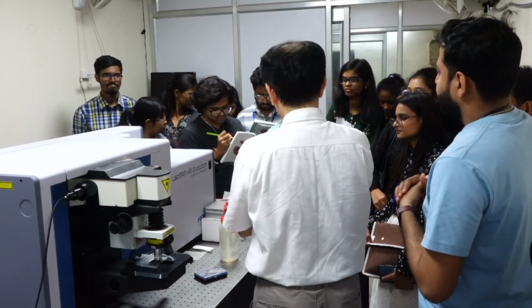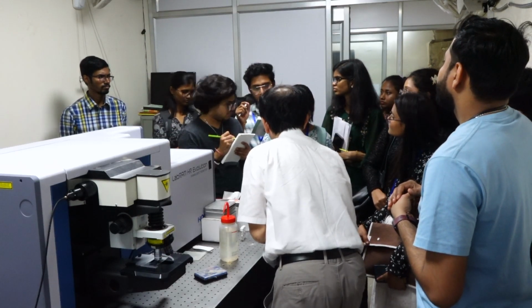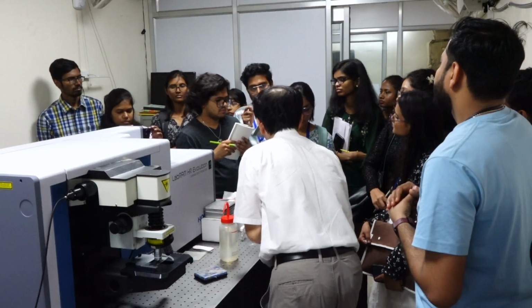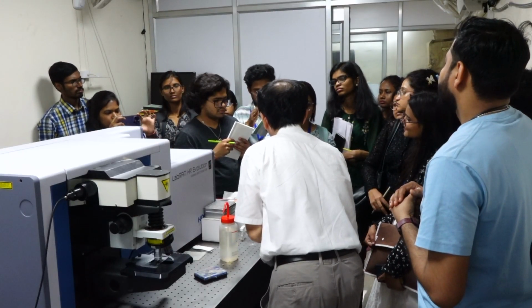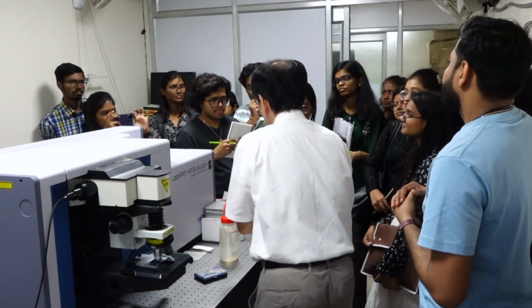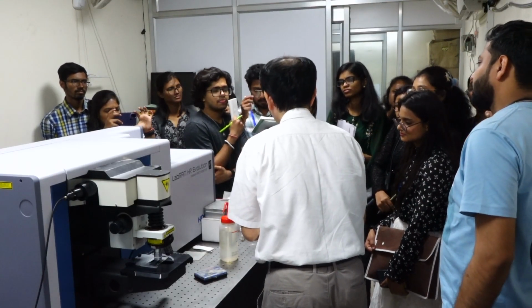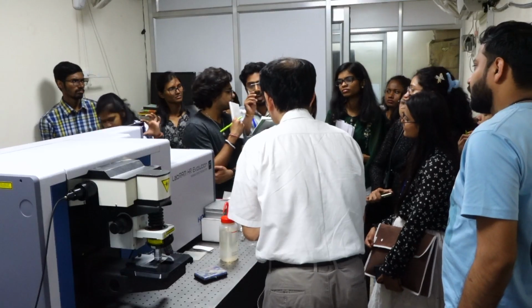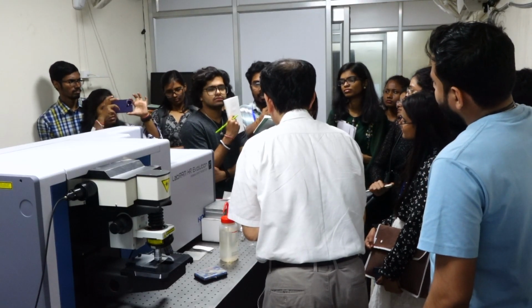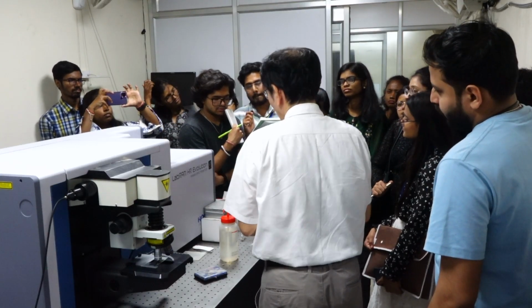Any other question? Is there any need of sample for strong Raman signal between the larger sample area and small sample area? My question is, is there any effect of area of sample on getting a strong Raman signal?